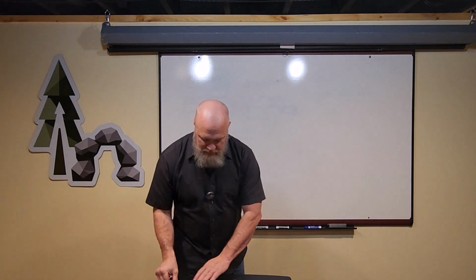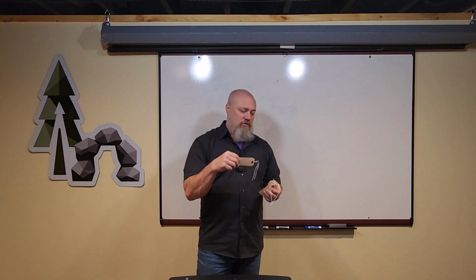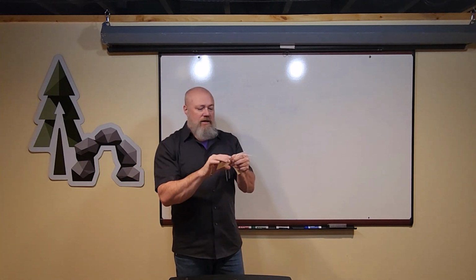Another piece of equipment that I'm going to hand out in the lab that comes in very handy are tags, right? Just these little tags. So as you define or clean off a structure, you're going to attach your tag to it, maybe make a note to identify it.